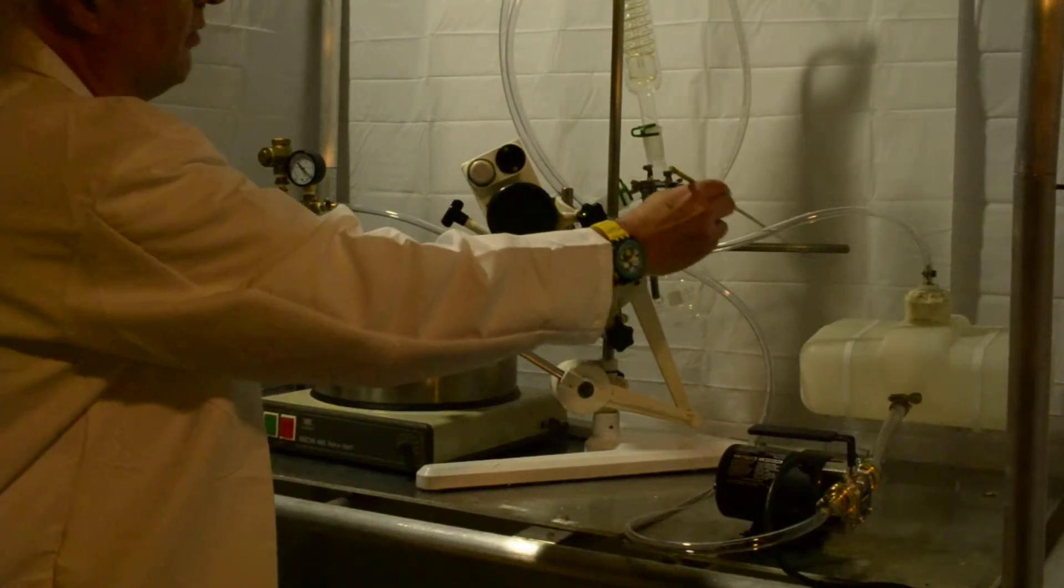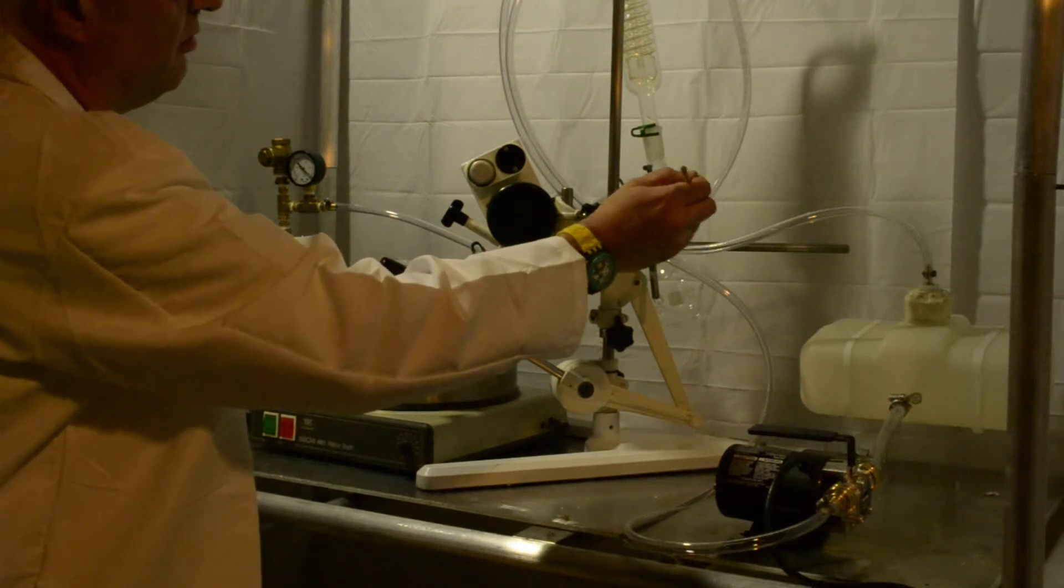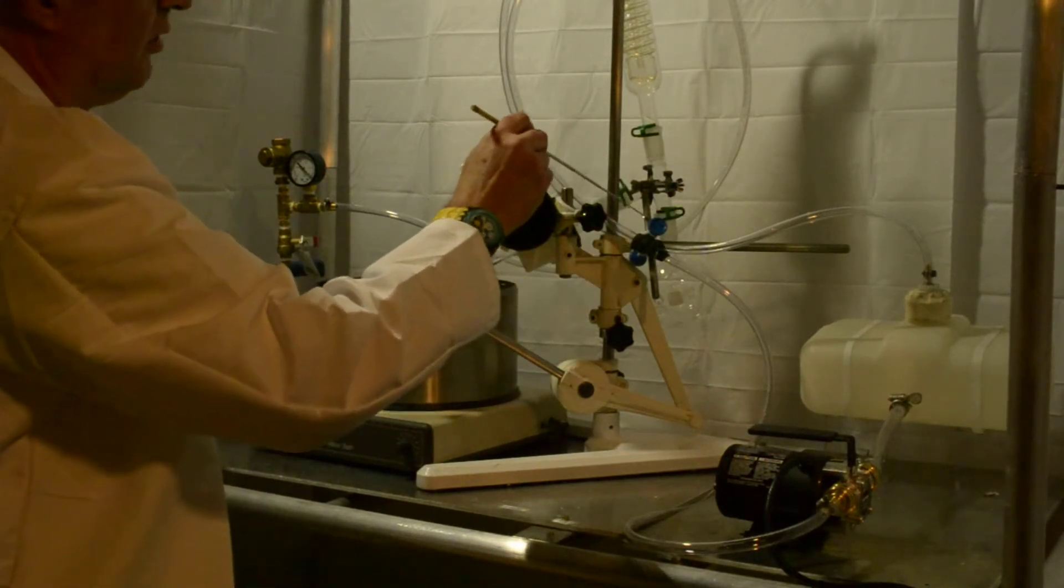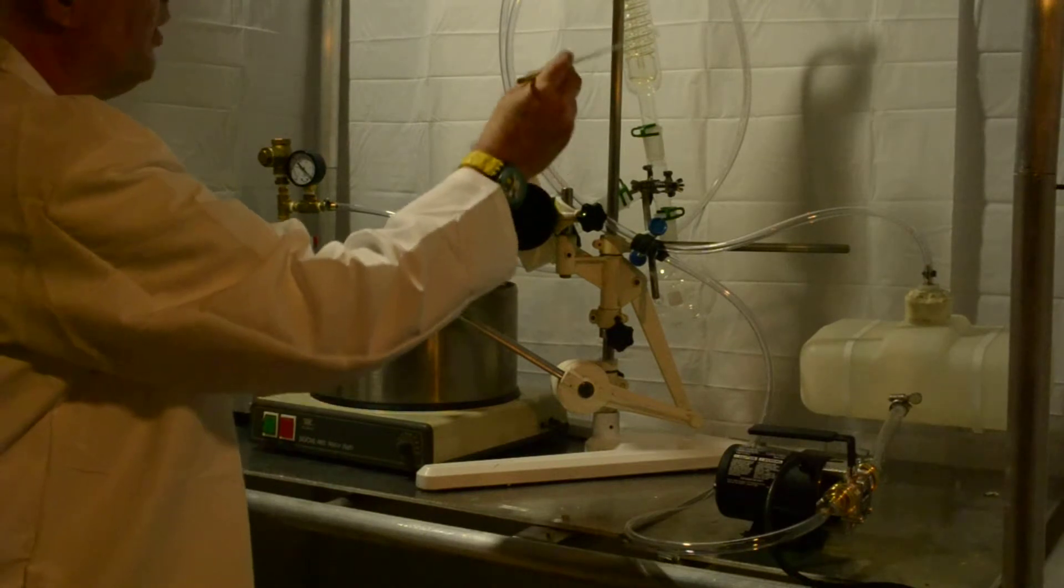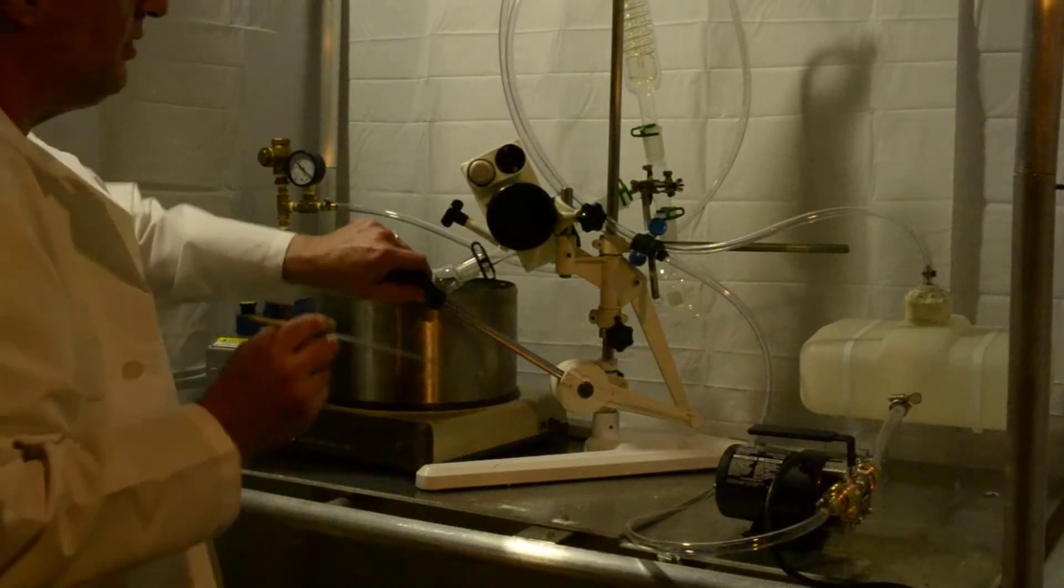This right here is a bar, Allen wrench is included too. It supports this bar here, or clamp I should say, which is supporting this whole thing, and it moves up and down with the unit.